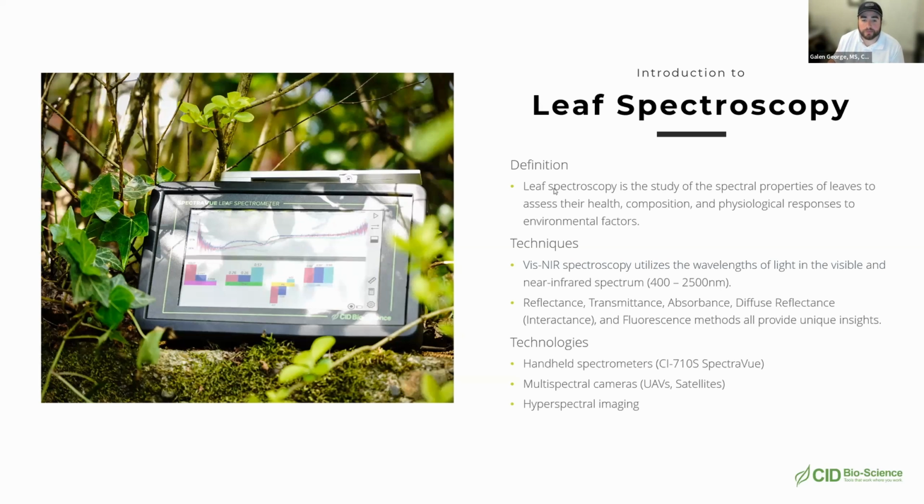The next question is, what is the preferred condition or timing to use the Spectravue? Concerns of abiotic factors that affect the readings at different times. Like I mentioned, it is a closed environment, so you're not going to have that much impact from environmental conditions. The biggest thing is rain, so wetness on the leaves. You need to at least pat those leaves dry before you measure them, otherwise that external moisture is going to cause issues.